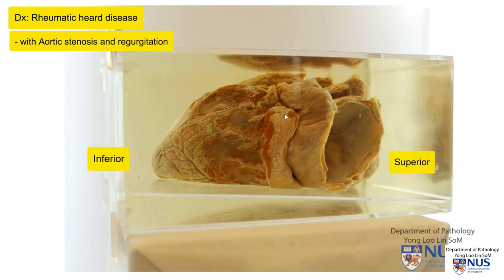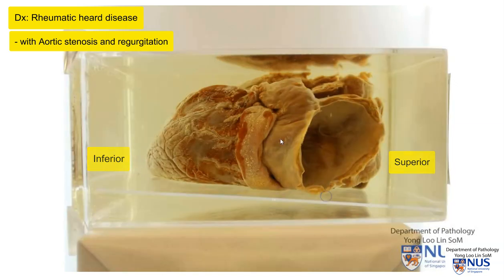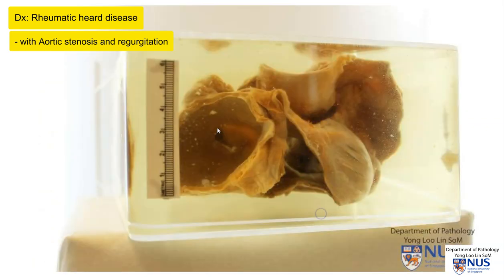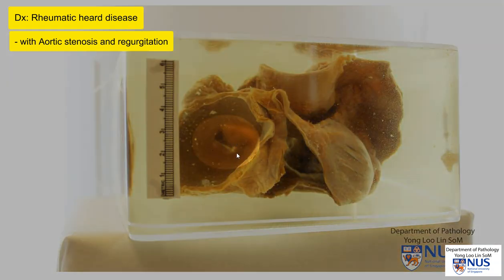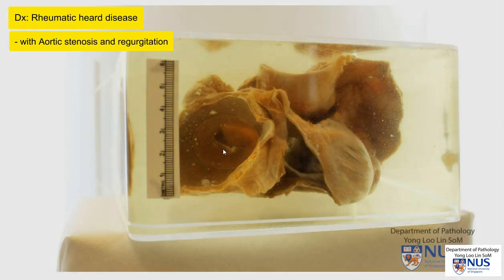Here is actually the left lateral surface of the heart. This is the apex and this is inferior and this is superior. And here is the left atrium. Looking into this, here is the orifice or the opening of the mitral valve. We can see that it is quite deformed and it's quite slit-like in some areas.